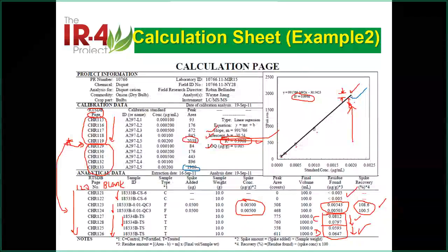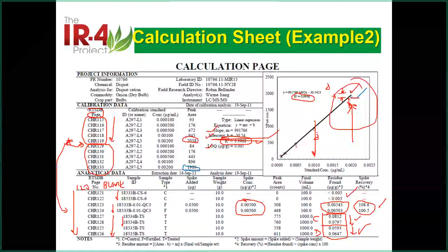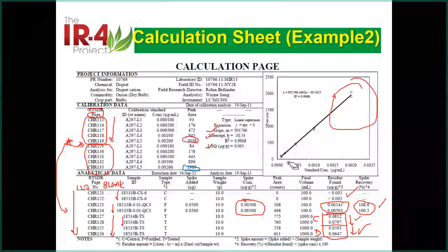So in this case, the difference here, the delta, is big. Versus here, even though the percentage is big, the real number is small. So this is the point, the biggest thing you need to worry about. If you just talk about the R squared value, the last point is always the biggest one you need to worry about. Can we handle that? Can we do it a different way? Yes, you can, but it's getting more complicated.